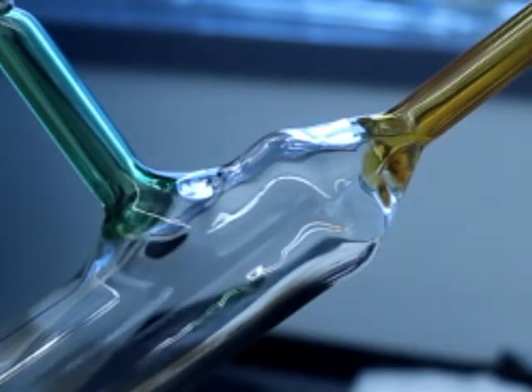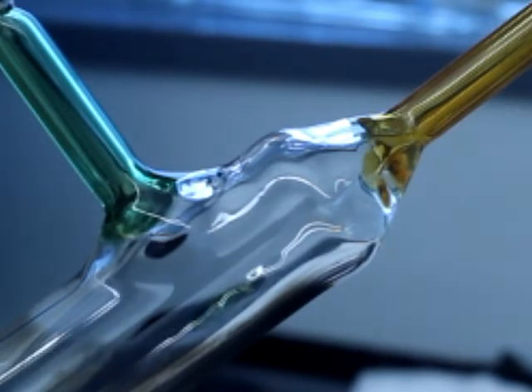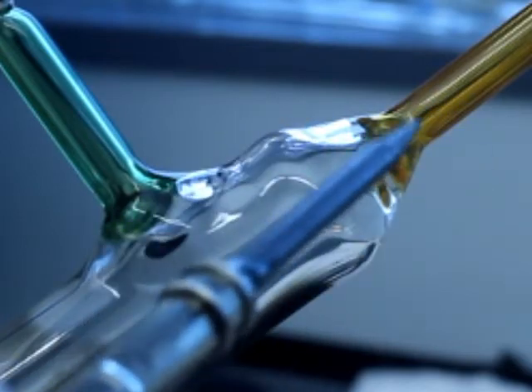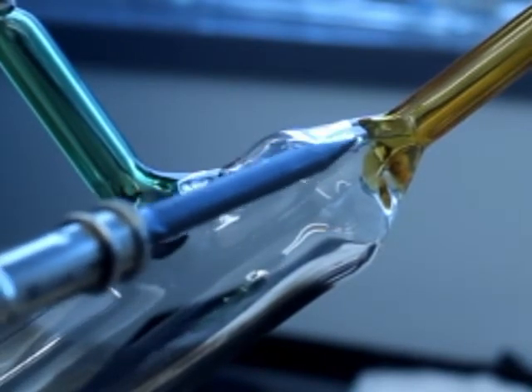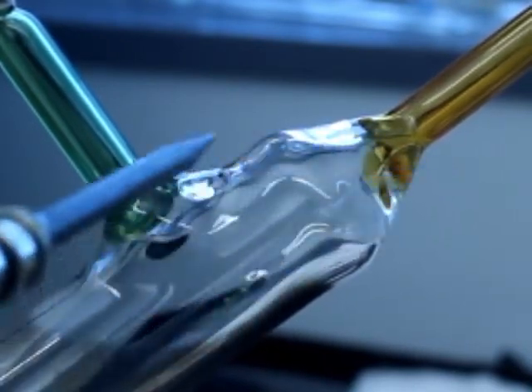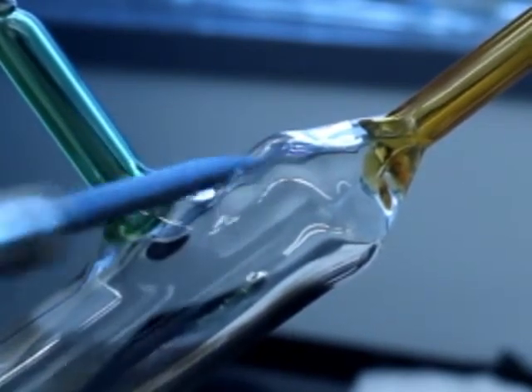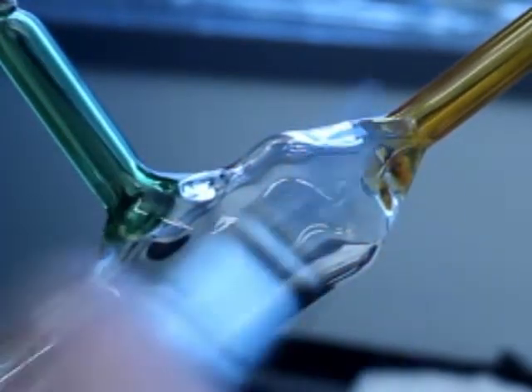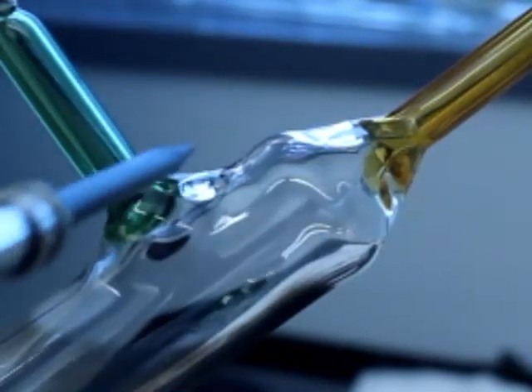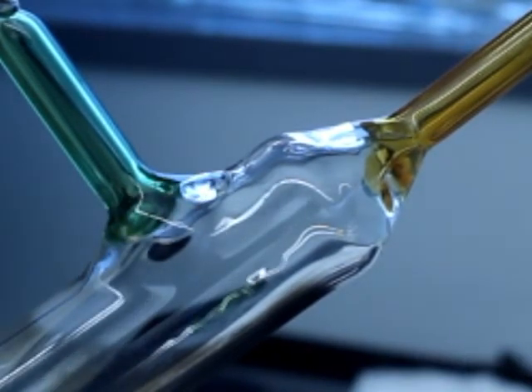The piece has had a little bit of time to cool down and hasn't cracked yet. So, the mistake, several, that I made was I thought a little bubble or something had come loose here at my straight seal and that there was a pinhole, but as it turns out the pinhole was down here under that thick lump of glass. So when I blew, the air was coming up over here, and I knew it was something squirrely because I couldn't see it, but I could feel the air, but I thought for certain that I had gone over here and checked that, but it was fooling me.